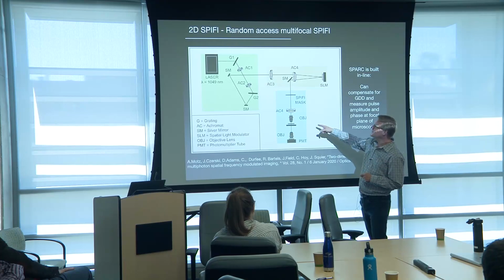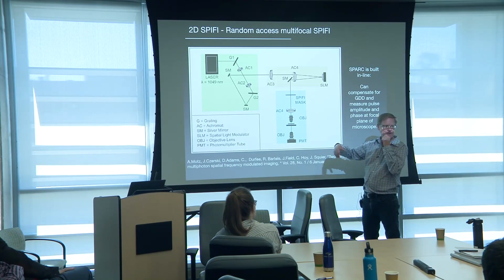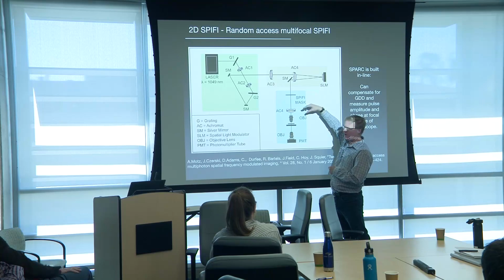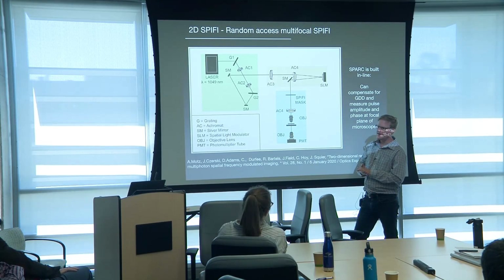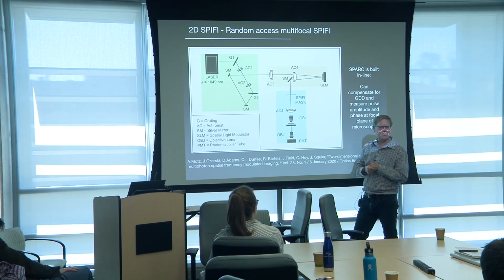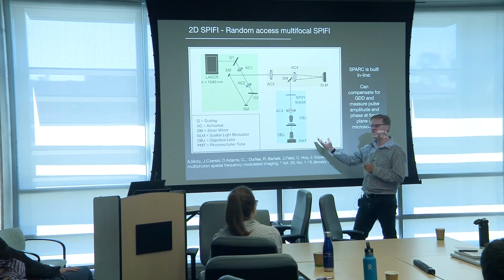And the idea where we did the random access is that I need feedback from this community. With this, I could actually get rid of this too. I could create multiple foci if you want, and that way you can go really deep with this system, because now it's your light budget. And if there are certain features you want to hit without heating up other things, I think there's flexibility here.